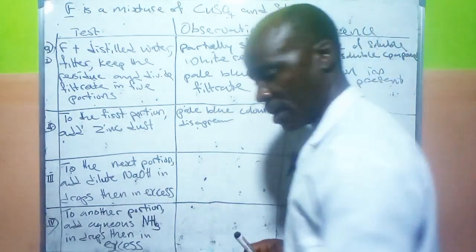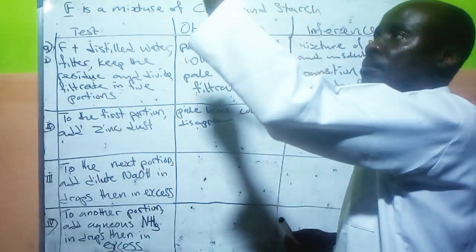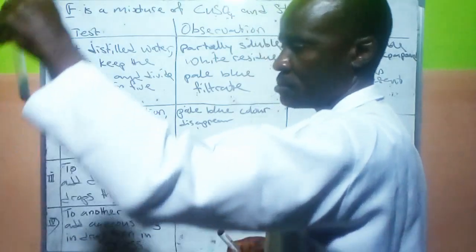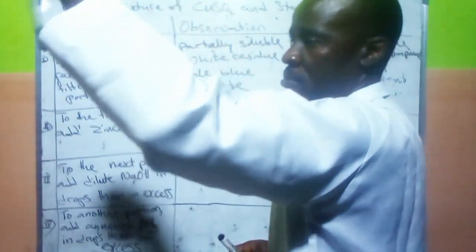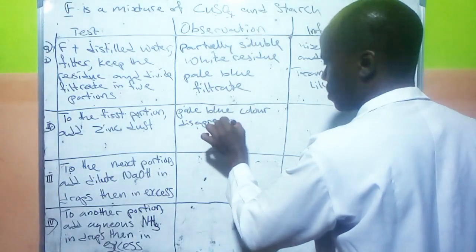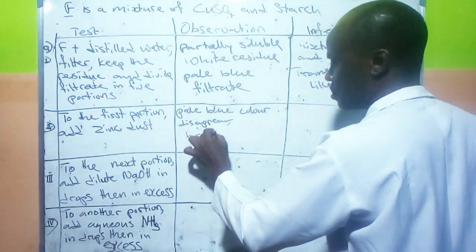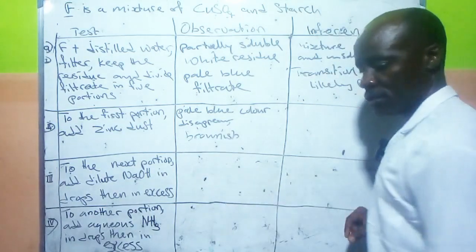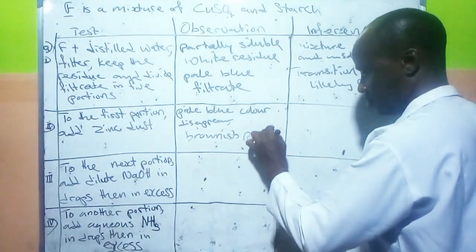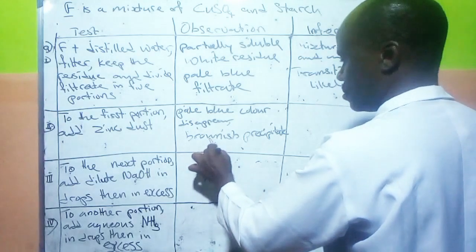And then what again do I have? And then I have that somewhat brownish precipitate formed.